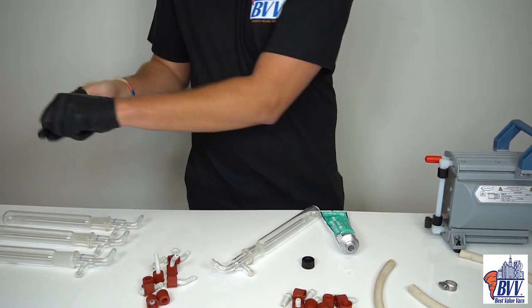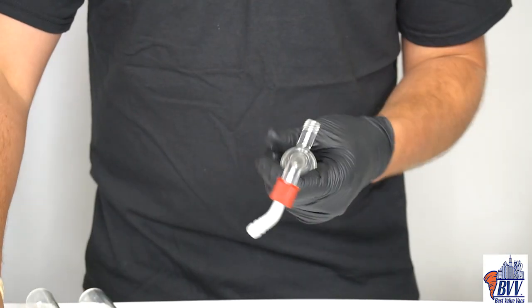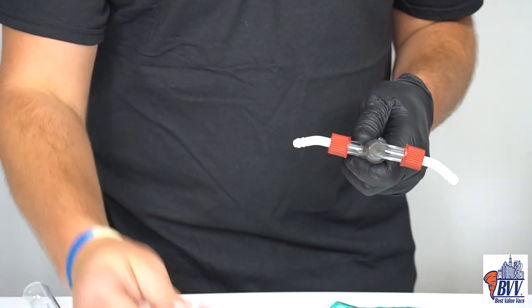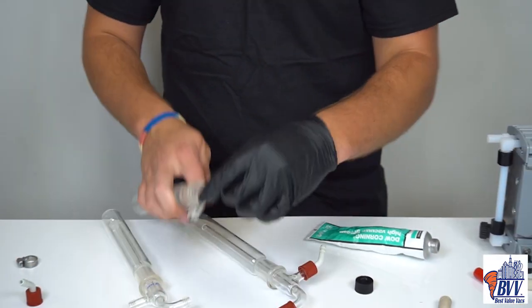Take this glove off. So now that your vacuum joints are all greased up, we're going to add this GL14 fitting to each one, and it comes with a bent barb. Some of them will be straight. I prefer to use the bent ones when you're going cold trap to cold trap. You can use a straight one when you're going to the pump or to your system.